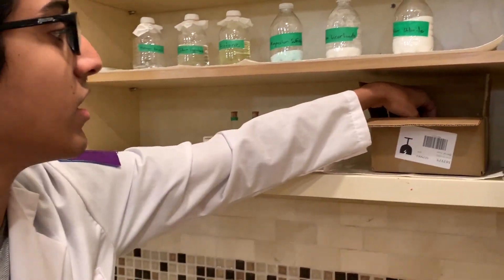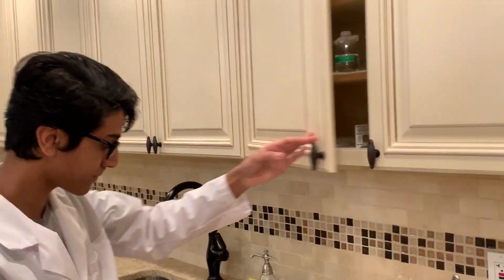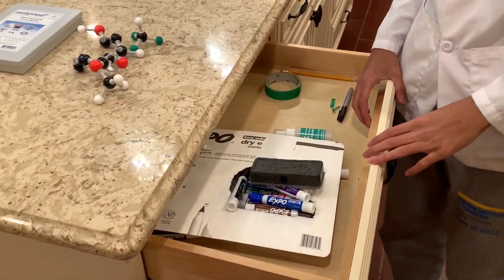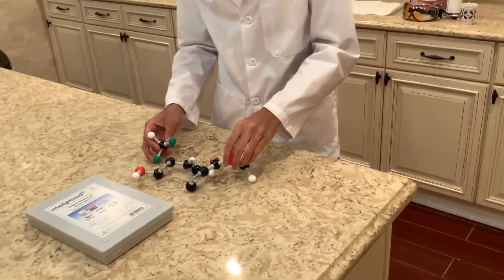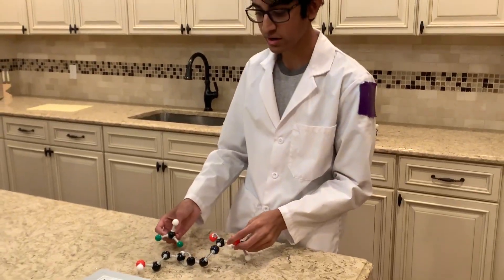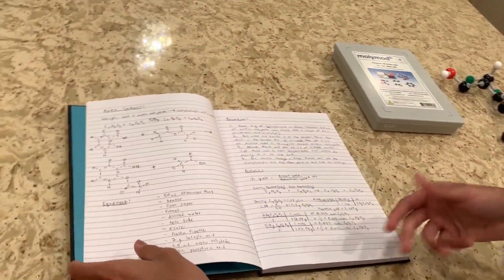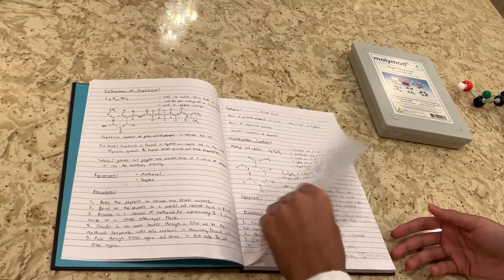And this is where I keep all my other test tubes for the future. Over here I have a bunch of markers and stuff for the videos — you guys know I use the whiteboard over there. And these are great for showing the molecular structure of things, which I've shown in the beginning of some of my videos. And this is a notebook I use for planning out my videos, trying to understand what I'm going to say, my procedure, stuff like that.